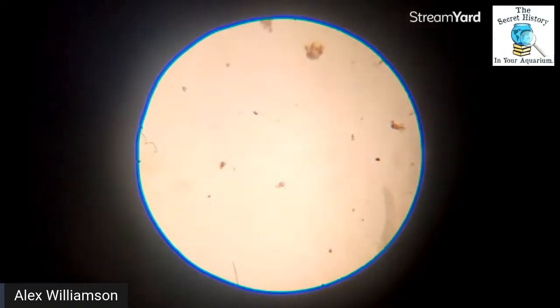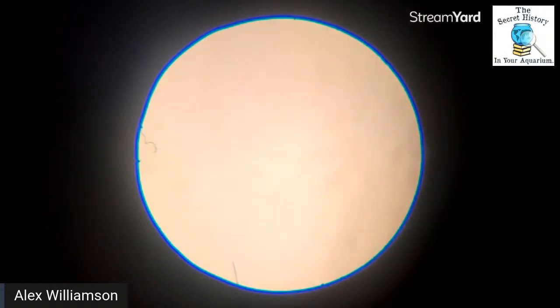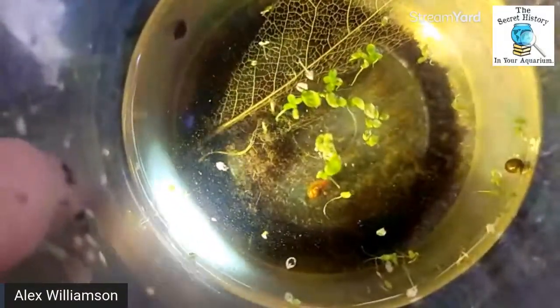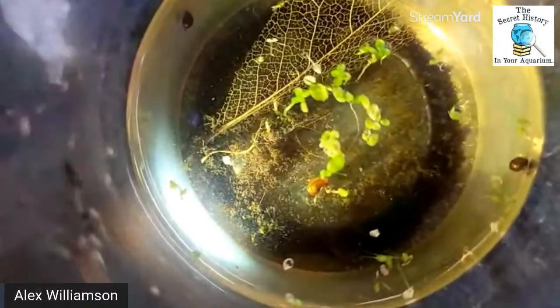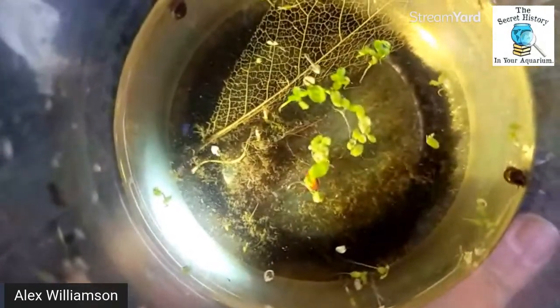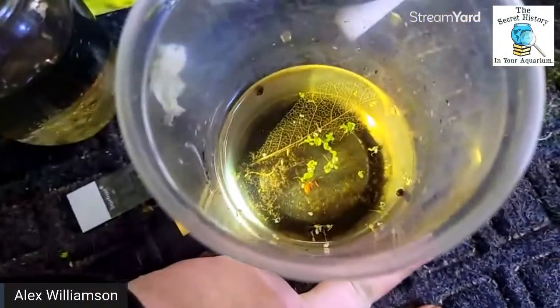All right. Well, in any case, I'm going to pull this back out again because I need to sip Dr. Pepper. We're going to put this little copepod back in his tank, and I'll show you how very small this copepod is. We'll be able to make it out with my phone, but barely, and we'll need a strong LED on it. All right. So pardon the mess here, but what were those copepods? They're those little white dots moving around in here. And for scale, let me put my finger here. So little white dots, hand, little white dots.